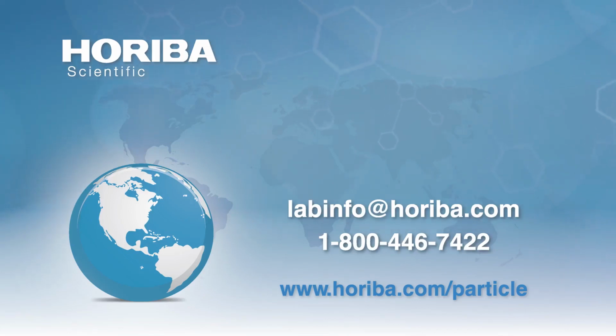So here's the interesting thing. Although you get an isoelectric point from the literature, the only true way of finding out the profile is to measure it yourself. Thank you.